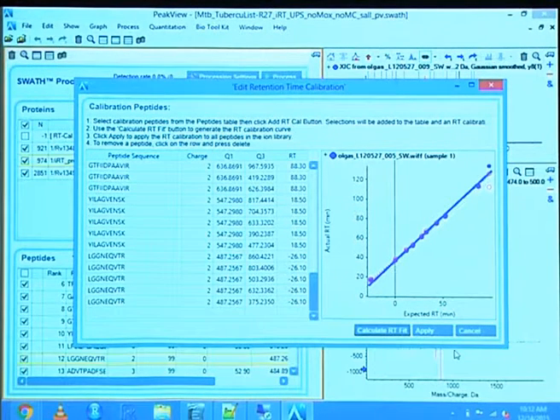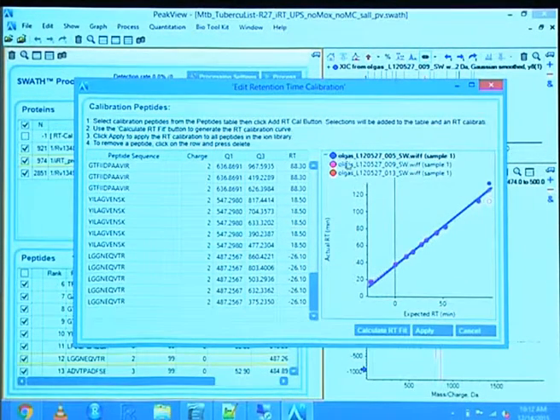So yeah, Uli knows that, she had her time with it. Here you see, in this range, it now updated to what the actual retention time is. Before it was from 0 to 1, and you can see here these are the 3 files: the blue, the red, and the purple one. You can go down here and select a different one and then see how these different linear regressions are.